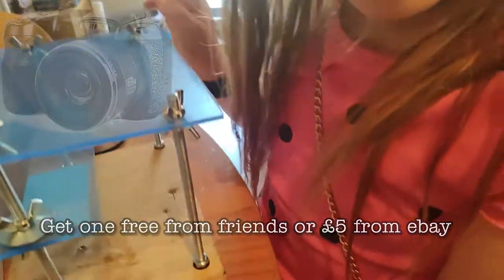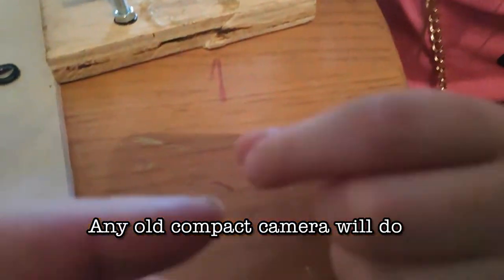Let's have a look at this then. Let's put it through — there it goes. And look, we can see the grains. That's really good. I think this is the best lens — the best quality one. Can we see the grains of wood? Yeah, we can. It allows us to focus right in.